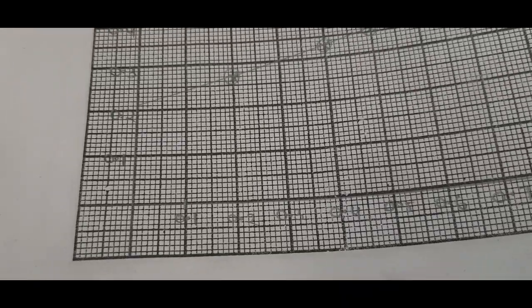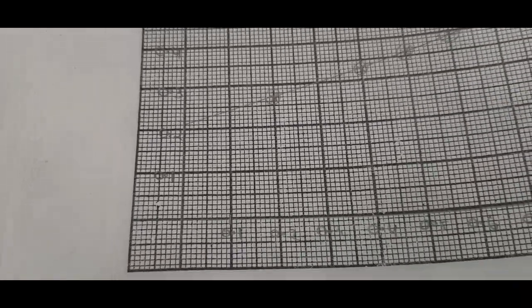Our aim of the experiment is to find out the viscosity of a polymer. So it cuts the y-axis at 0.23. Okay, so that's the result actually. But if you are asked to find out the molecular weight, then you have to use the equation that relates η_i with M. But the aim of the experiment here is to find only the viscosity, and that was found.